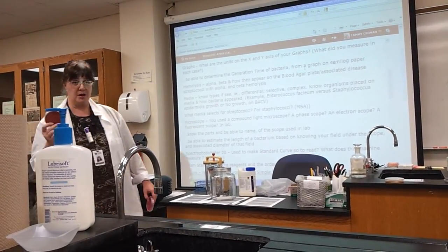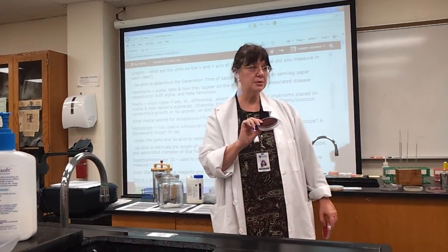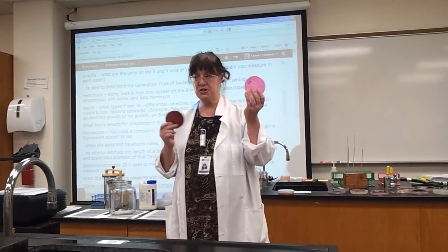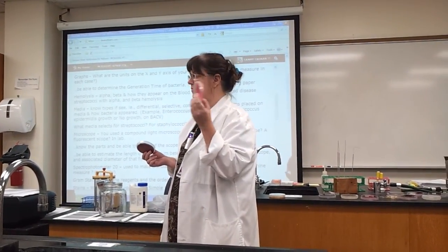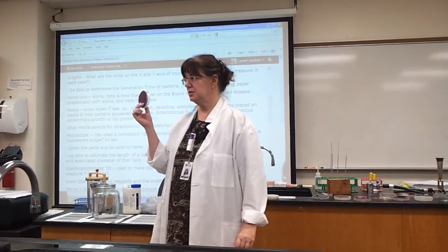The strep and the enterococcus to grow is the crystal violet. And the crystal violet would stop the staph. Learn your mannitol salts plate, because salts relates to salt-tolerant staph that can survive. Think of this one as the exact opposite.